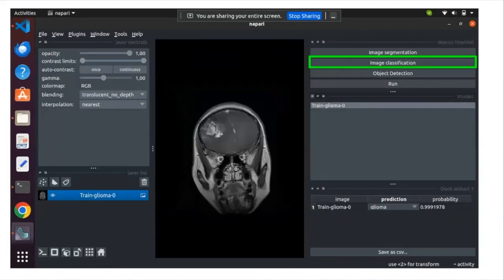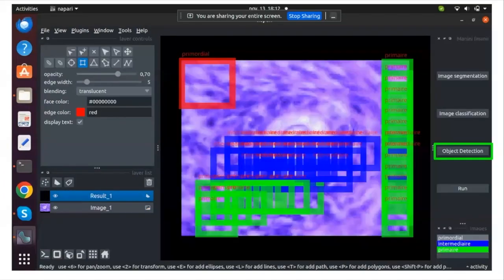When you want to classify an image, at the bottom you can see a table where you can find the result of the classification prediction. For the object detection tool, you can correct it by adding or removing bounding boxes. The model that runs the object detection task is a YOLO model in TensorFlow.